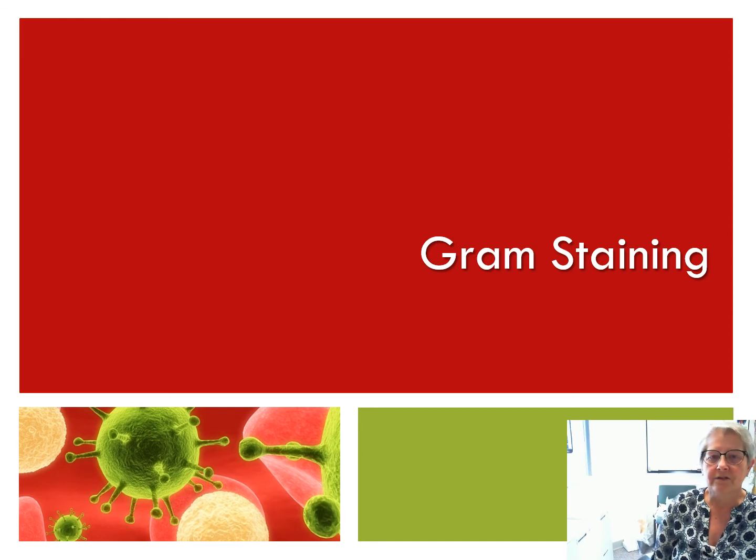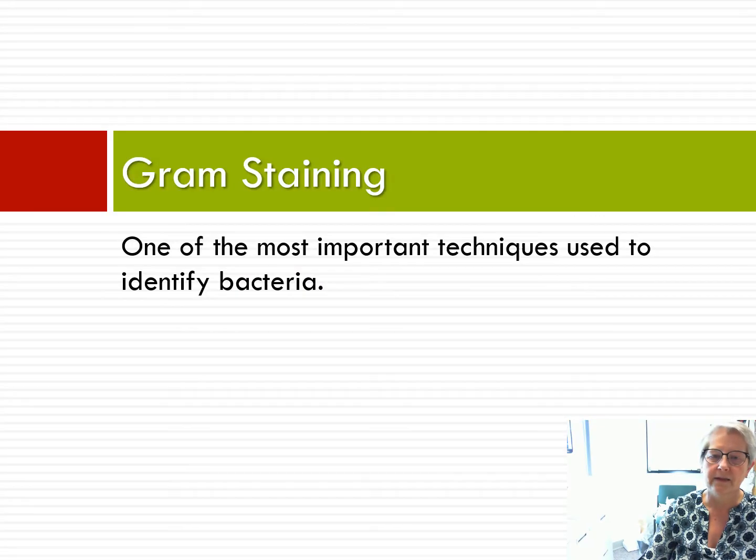This short lecture will introduce you to the Gram stain, a fundamental technique used in microbiology. Gram stain is one of the most important techniques used to identify bacteria. In fact, one of the first questions a microbiologist will ask is, what is the Gram stain? Is the organism you're telling me about gram-positive or gram-negative?